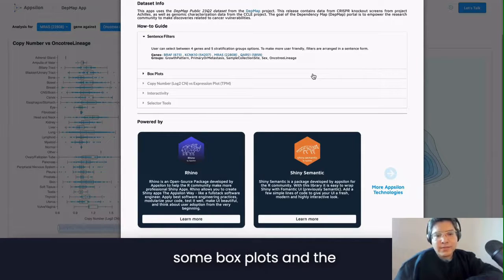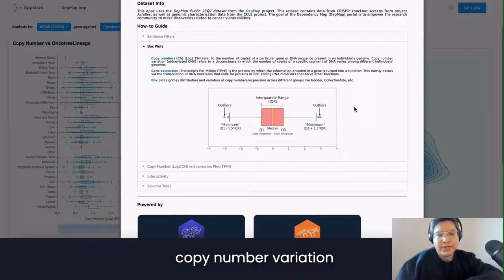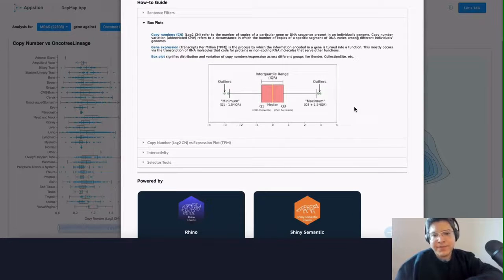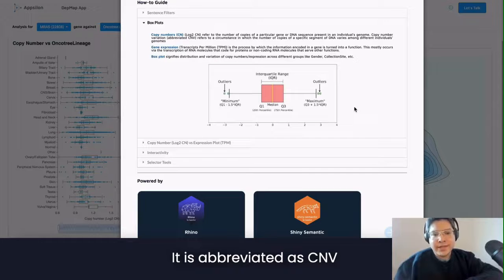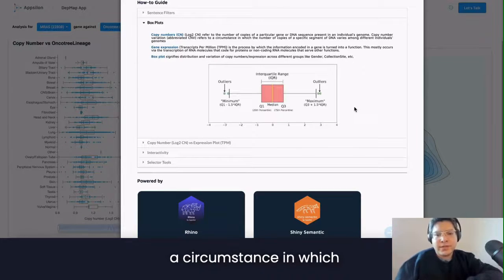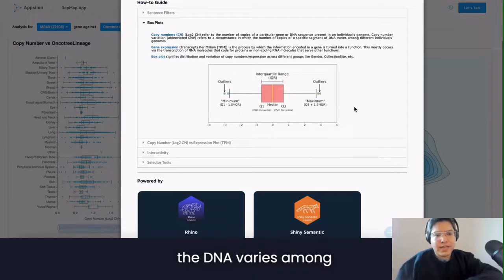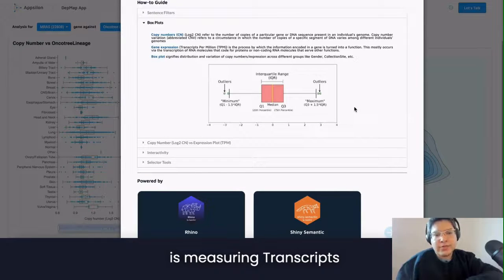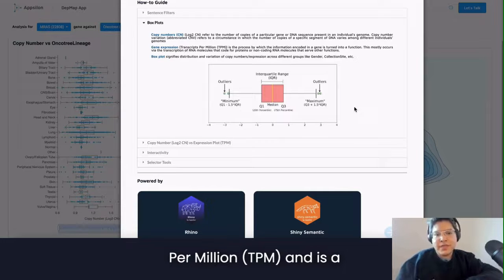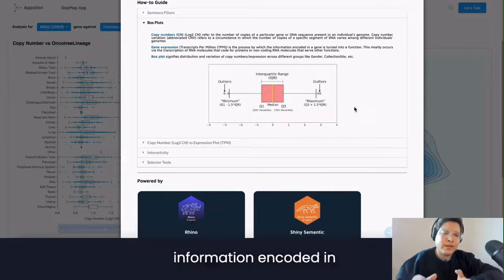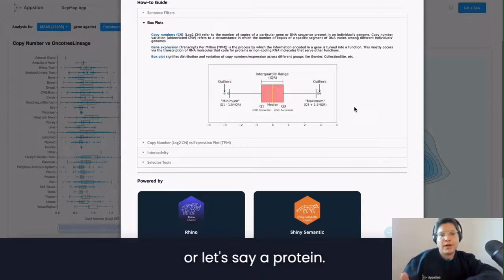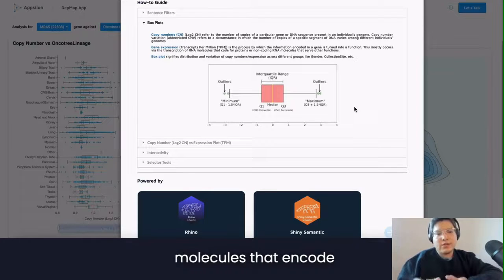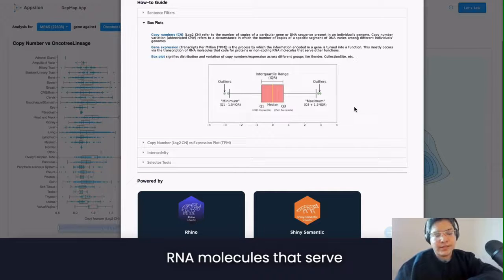We are going to see some box plots. Copy number variation refers to the number of copies of a particular gene or DNA sequence present in an individual genome, abbreviated as CNV. It refers to a circumstance in which the number of copies of a specific segment of DNA varies among different individual genomes.